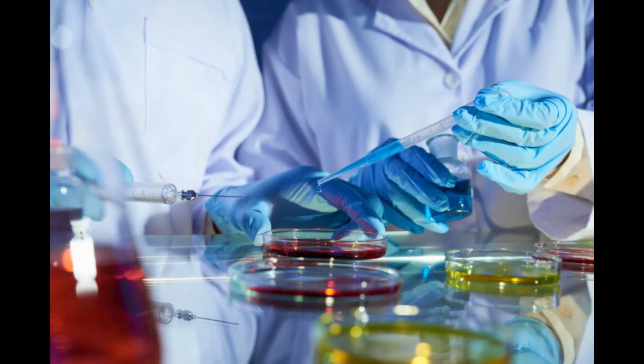Throw that loop away. You get a second clean loop. And here's the part where I usually have some people who do this part up. Do not redip, right? You don't get more Serratia. You've already got what you need on your plate. Do not get more. You take a second sterile loop with nothing on it, and you're going to come over here to your second quadrant, and normally you would turn the plate so that it's not so awkward, but you're going to come over here to your second quadrant, and you're going to streak over and grab some of it out of the first quadrant and pull it over and inoculate it there.